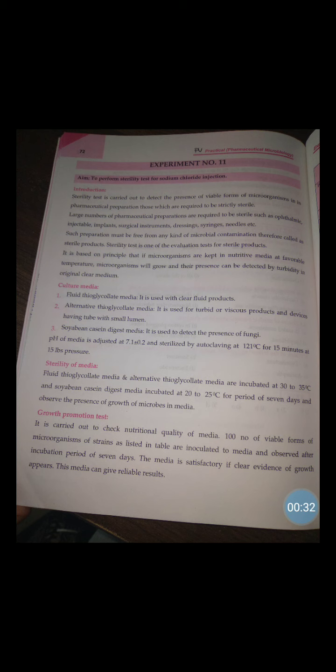The sterility test is carried out to detect the presence of viable forms of microorganism in pharmaceutical preparations which are required to be strictly sterile. A large number of pharmaceutical preparations are required to be sterile, such as ophthalmics, injectables, implants, surgical instruments, dressings, syringes and needles. Such preparations must be free from any kind of microbial contamination. Therefore, they are called sterile products.